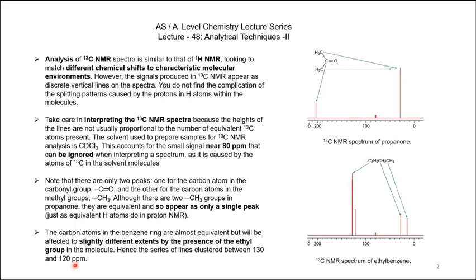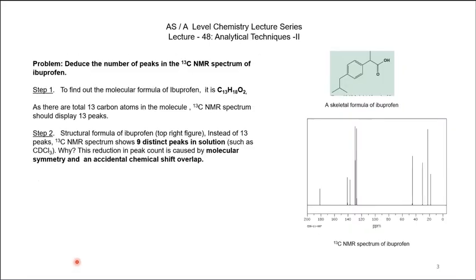Okay, we go to the next slide. Here we have to deduce the spectrum of ibuprofen: how many peaks would we expect to get?